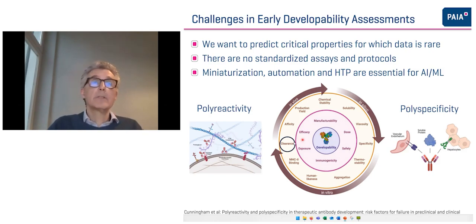So I will talk today a lot about clearance, and associated with clearance, of course, is polyreactivity. And I think it's important at this point to get the terminology right. So a lot of times people use polyreactivity and polyspecificity, meaning the same thing.